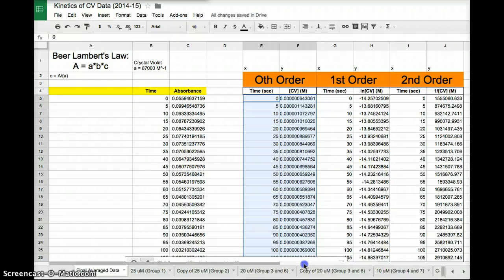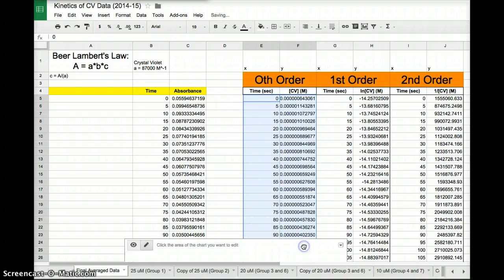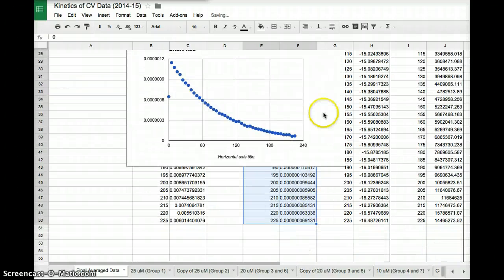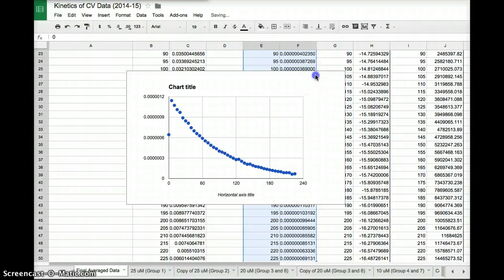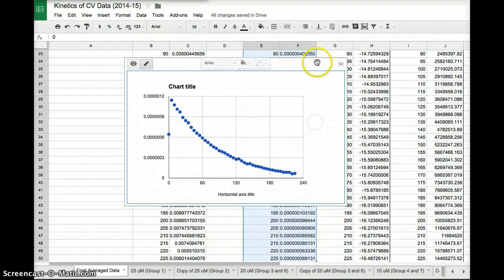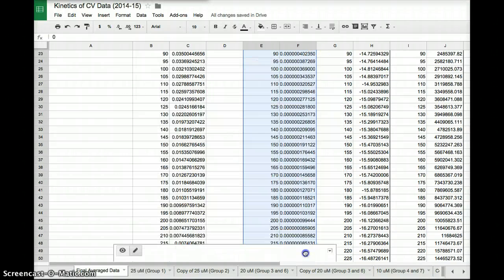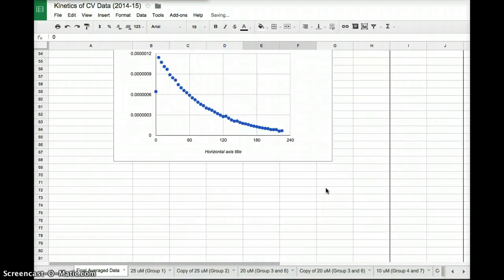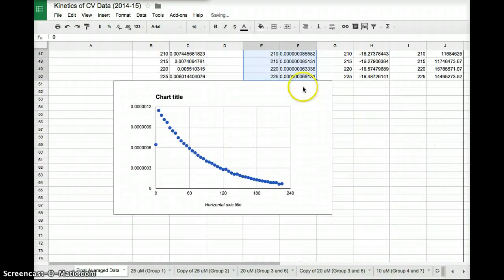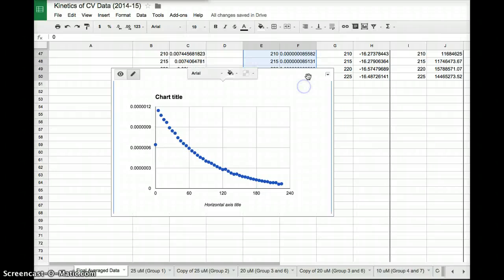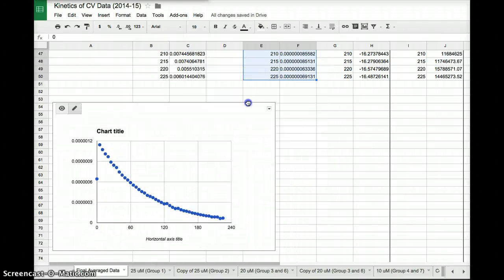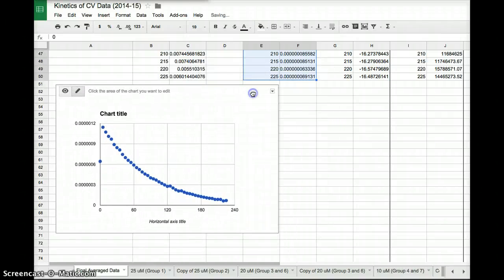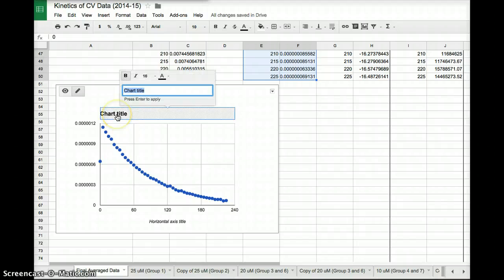Now what I can do is I can go ahead and just drag this chart down to the bottom here, just by clicking on it and moving it down. Takes a little bit of time here. But now I want to remember what this chart is. So I'm going to do some editing to it. I can just click on the chart title.